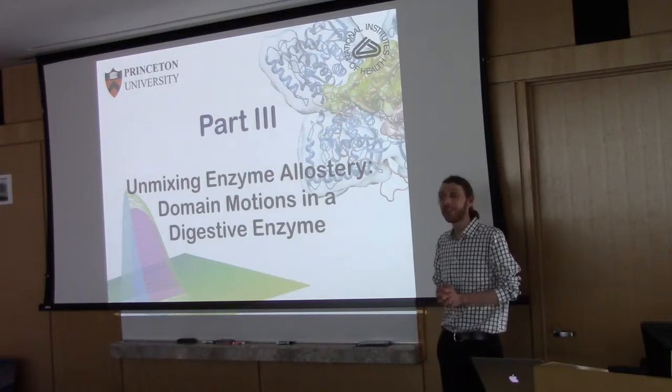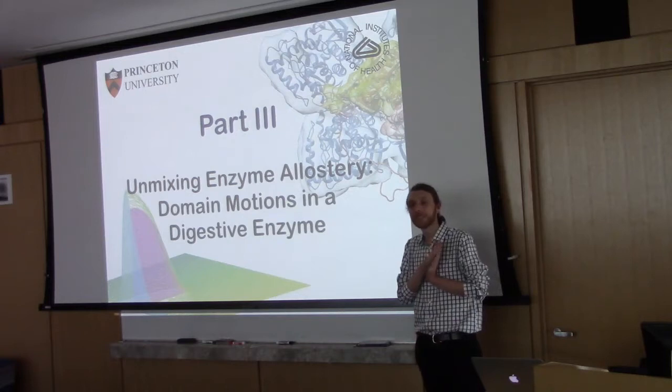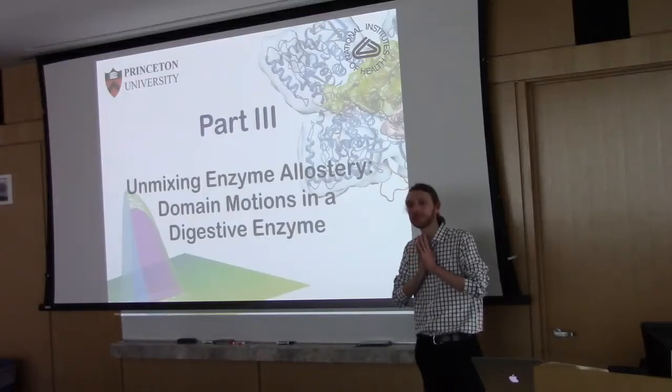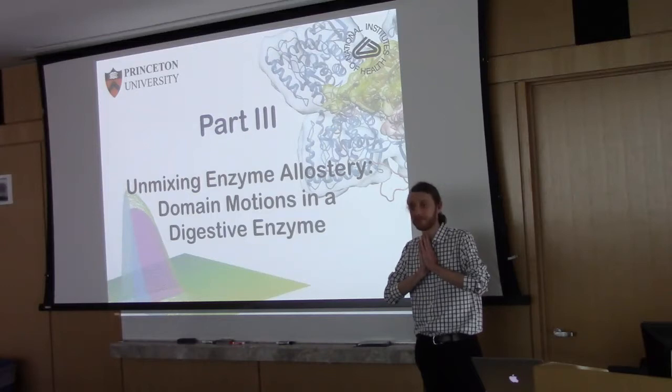I only bring that up because the last person that talked, Tom, talked about deliberately putting in different ratios of a dimer and a hexamer, and then getting these hybrid models in between them. Can you also do that with the SEC stuff?